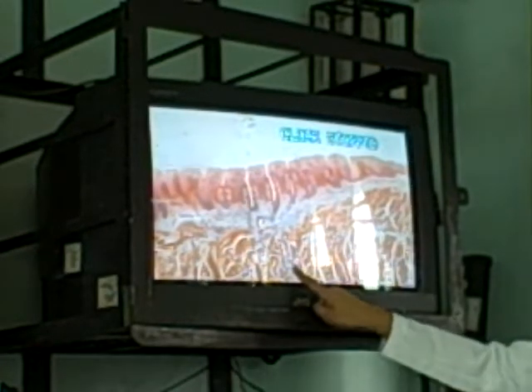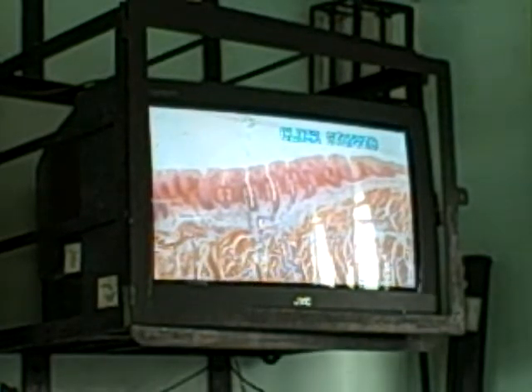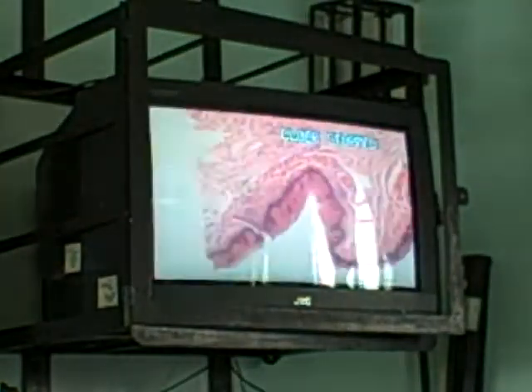These are your lingual glands that are responsible for cleansing the chemical substance that will stimulate your taste buds. I didn't commit to any type of lingual gland, whether anterior or posterior, because this is a rabbit, and I'm not sure of that, but it is a lingual gland. Okay? Next, go to esophagus. So this time you have to identify the layers.